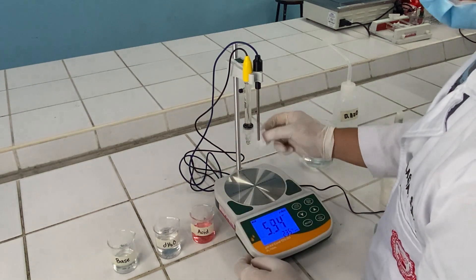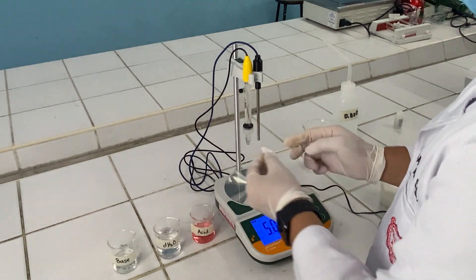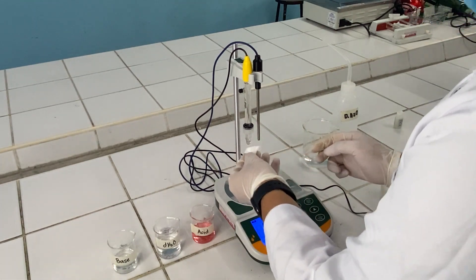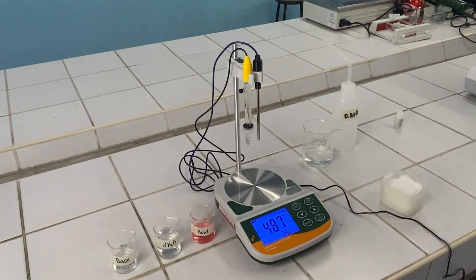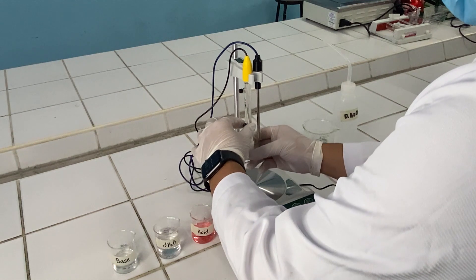Always be careful in handling the bulb since this is very sensitive. Once you have finished reading all your solutions, recap your electrode bulb.